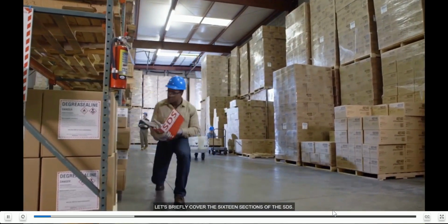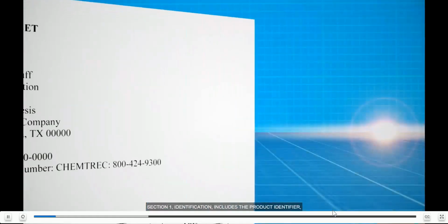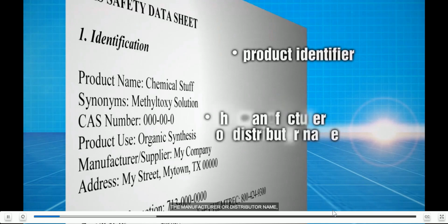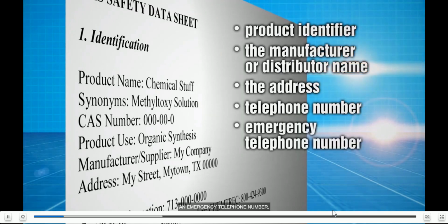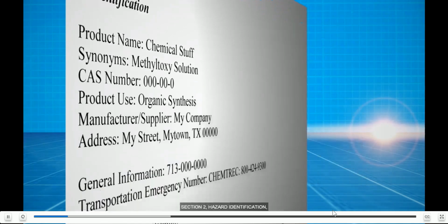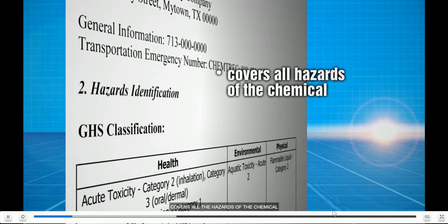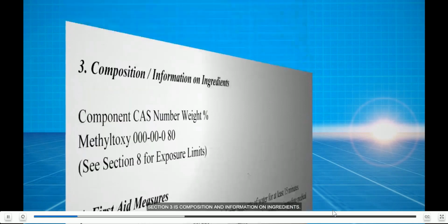Let's briefly cover the 16 sections of the SDS. Section 1, Identification, includes the product identifier, the manufacturer or distributor name, their address and telephone number, an emergency telephone number, recommended use, and restrictions on use. Section 2, Hazard Identification, covers all the hazards of the chemical and the required label elements. Section 3 is Composition and Information on Ingredients. It provides information about the chemical's ingredients, including trade secret claims.